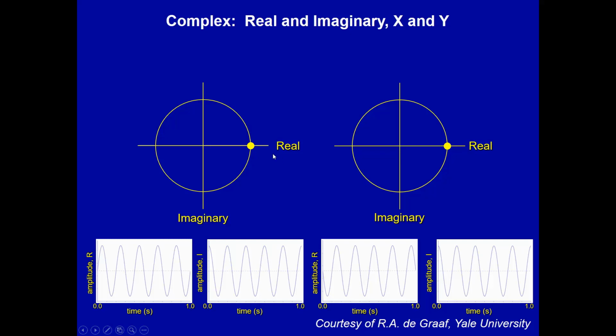And in the spectrum, what you'll see is your primary peak where you know things belong, and then on the opposite side of your carrier frequency, you'll see a very small peak at the mirror location. That's because the quadrature detection is out of adjustment. It's rare that that happens, but you'll hear about real and imaginary channels, and you're going to hear about quadrature detection.